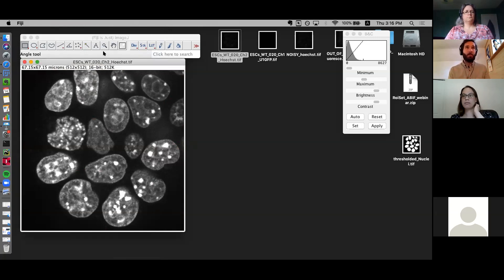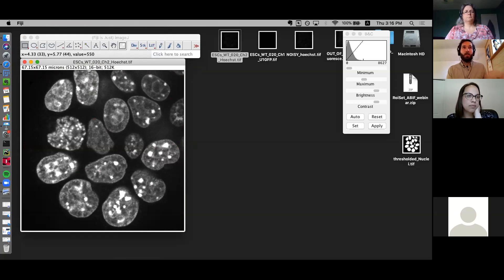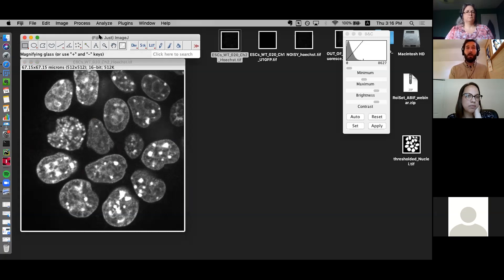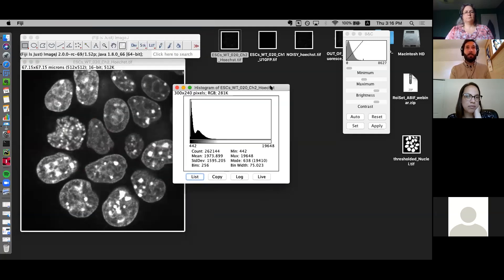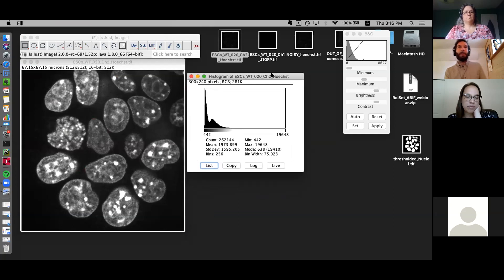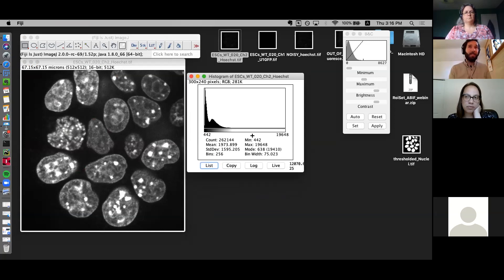It's usually a good idea to look at the histogram — the range of intensity values in the image. Click on Analyze, then Histogram. You get a frequency histogram of intensities. The minimum value, the dimmest pixel, is at 442 gray values, and the maximum is 19,648. There's a peak early on around 600 gray values, which generally represents the background. Then there's a further peak around 2,000, which is generally our signal.